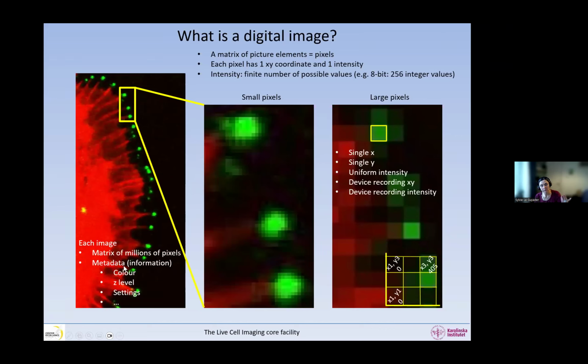So if you just randomly choose JPEG or TIFF, for JPEG, you will definitely lose the metadata, but for TIFF, you may also lose the metadata, or it's scrambled. It also happens quite a lot. So it's really important to save the images in the original format so that you do not lose the metadata.